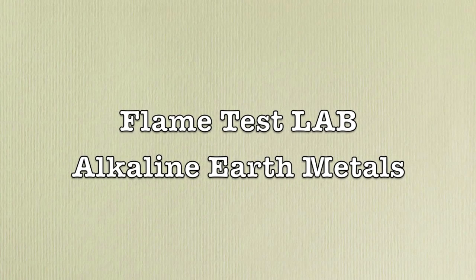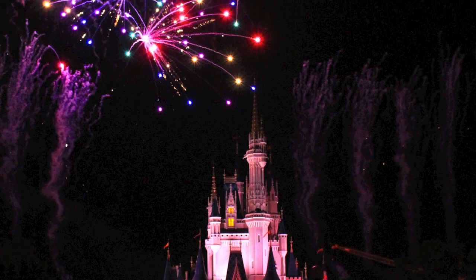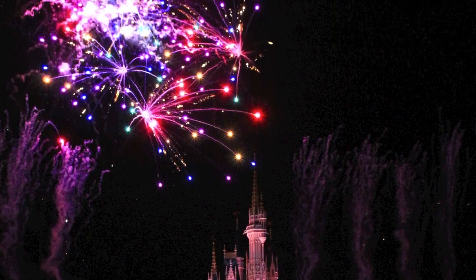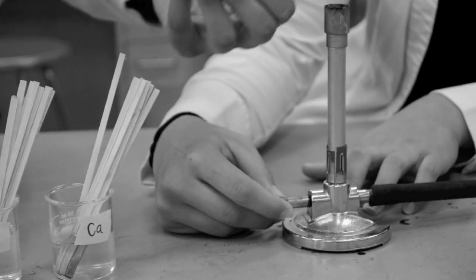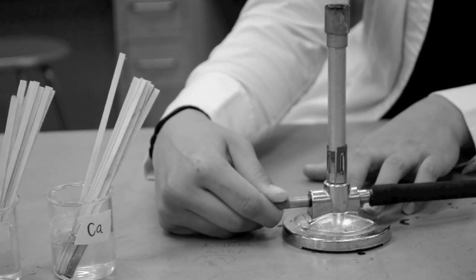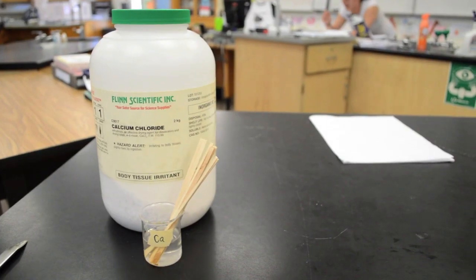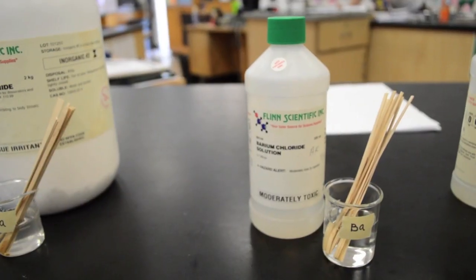Certain alkaline earth metals are used in firework displays and produce colorful, vibrant lights when ignited. On a smaller scale, the flame test lab allows a visual representation of the characteristic flame colors these metals emit. The three metals we will use in our flame test are calcium, strontium, and barium.